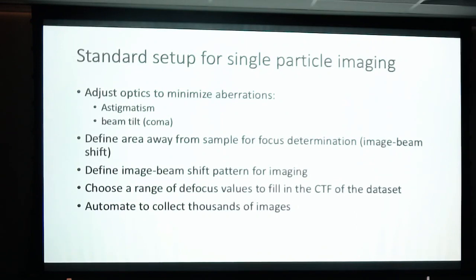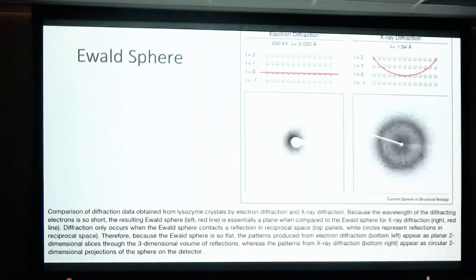Now, I guess when you're setting up for, I'll skip this. I talked about the Ewald sphere a little bit a while ago. So this is for X-ray beams. This is a cartoon of the Ewald sphere. So when you collect your diffraction pattern, you see these curves, where this is what you're actually collecting at this particular view.